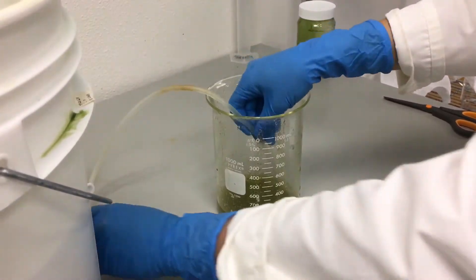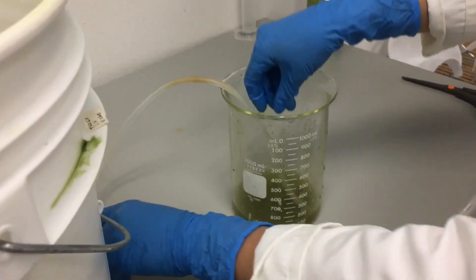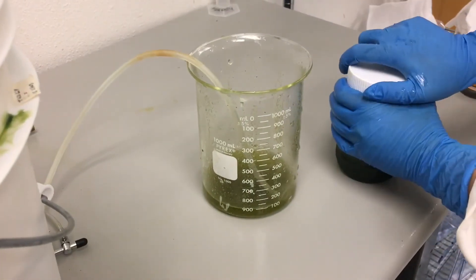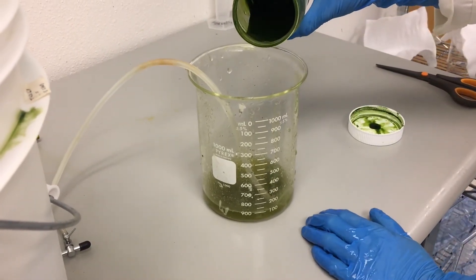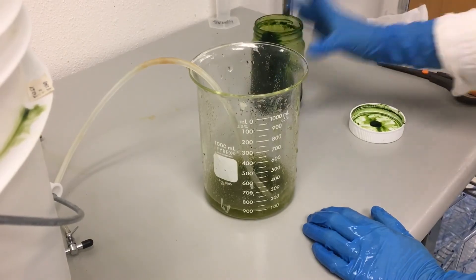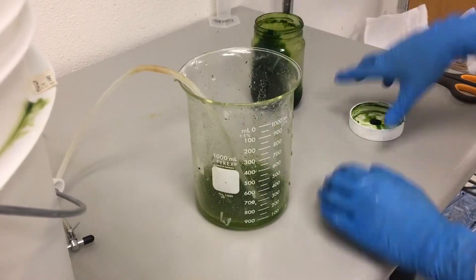We can keep this rotifer harvest on our bench top to use throughout the day; however, we need to add an air stone and some algae to feed them. They will easily survive in the five parts per thousand salt water, however they will not breed very readily.